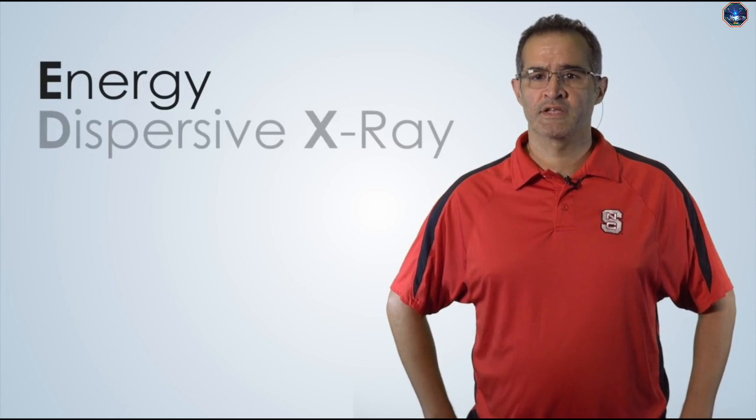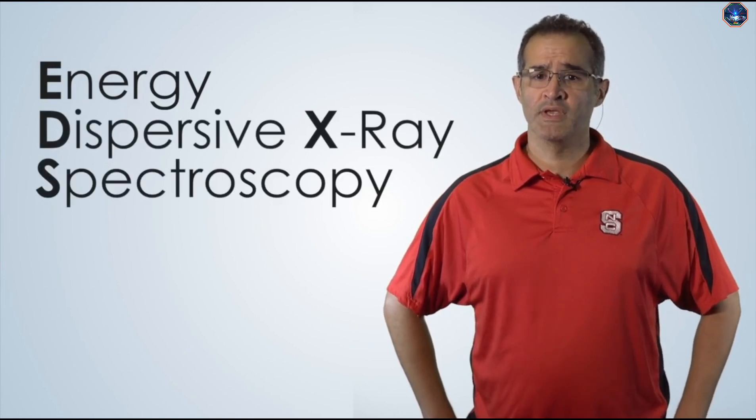In this video, you will learn how to prepare a sample for an energy dispersive x-ray spectroscopy experiment, or EDS experiment. Since we perform energy dispersive spectroscopy experiments in electron microscopes, preparation of a sample for EDS is the same as sample preparation for SEM.